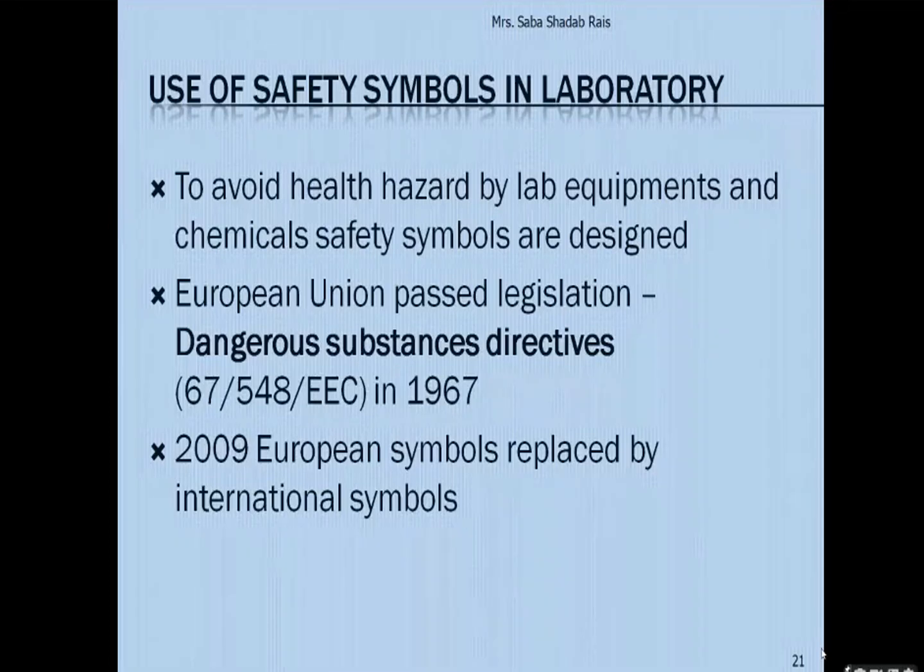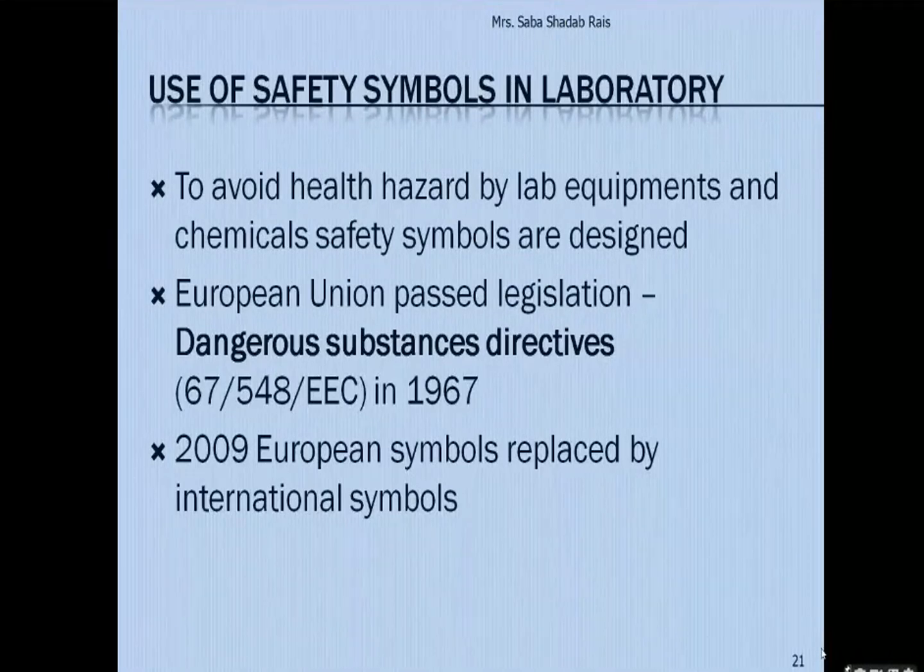So who will follow in our laboratory? If you enter our biology laboratory, you will find there are more than 500 chemicals. Even your teacher may not know all 500 chemicals. So what can we do? There must be some symbols. Initially, to avoid the health hazard from lab equipment and chemicals, they designed a certain type of safety symbol. The first idea came in the minds of the Europeans.